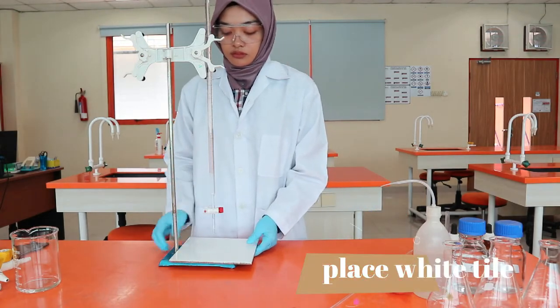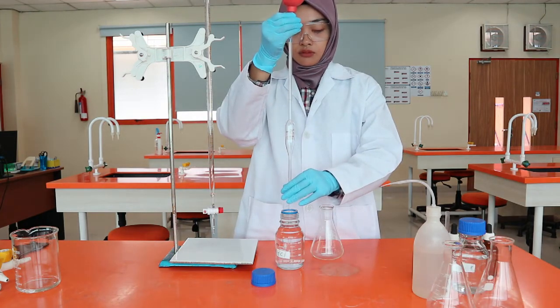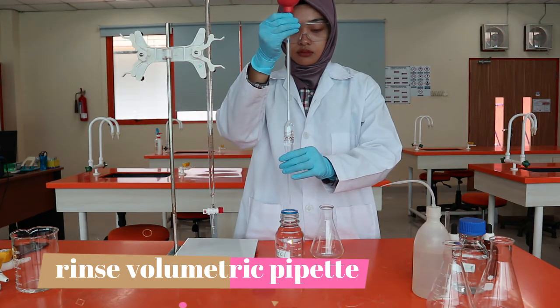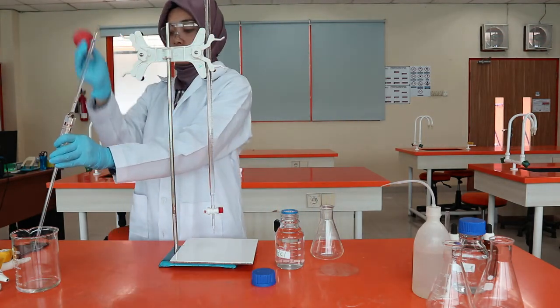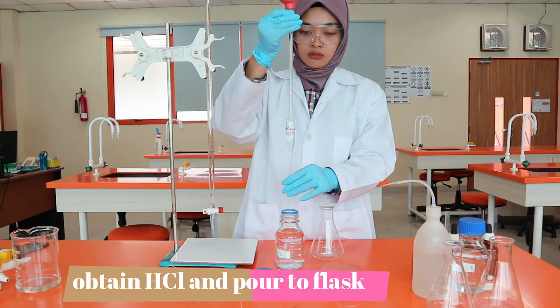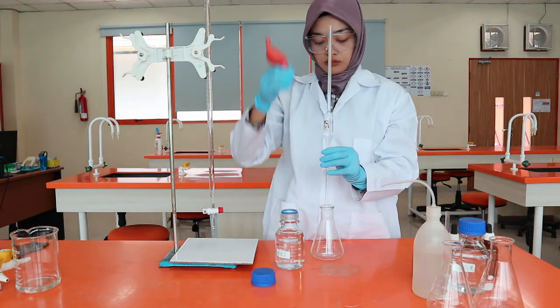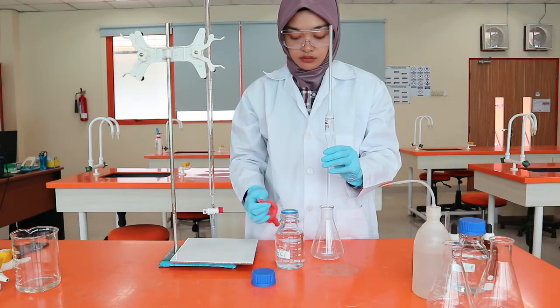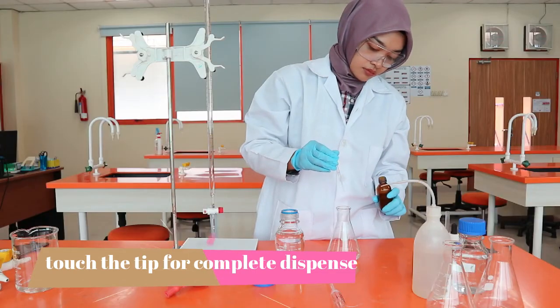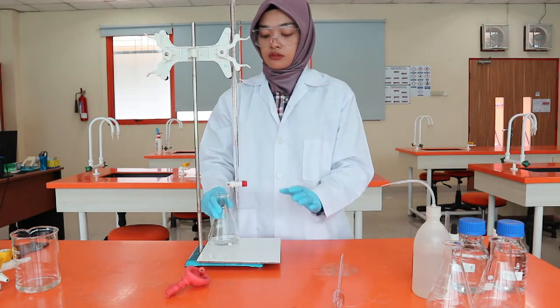A white tile under the burette will help you observe colour changes better. The volumetric pipette also needs rinsing before use. We do this by filling it up with the solution we will use, then draining it to the waste beaker. Obtain 25 cm³ of hydrochloric acid using the volumetric pipette and place it in a clean conical flask. Touch the wall of the flask with the tip of the pipette to fully dispense the solution. Add a few drops of PP indicator to the flask, give it a swirl, and then you are ready to titrate.